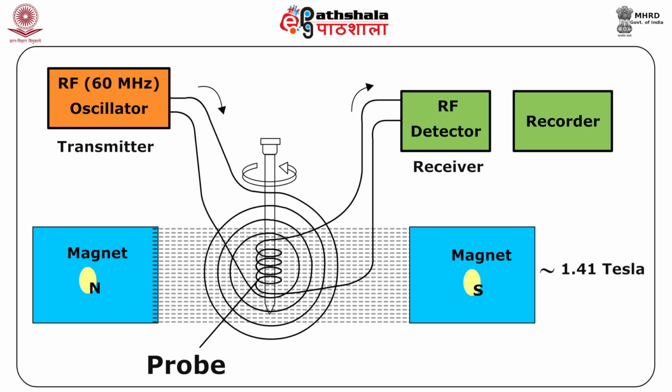Now, the sample is held in a strong magnetic field and the frequency of a source is slowly scanned. There are two orthogonal coils of wire that serve as antennas for radio frequency radiation. This can be seen easily in the figure.